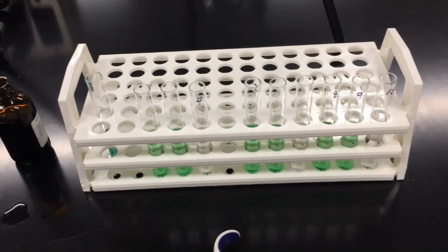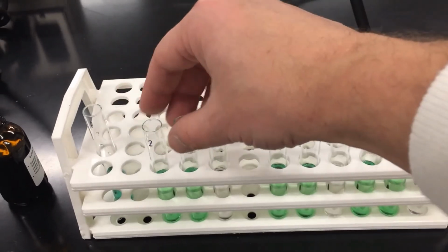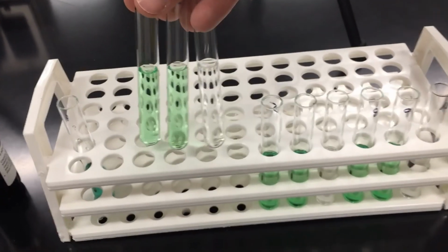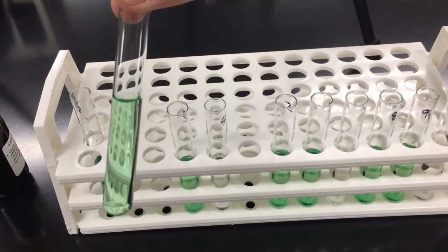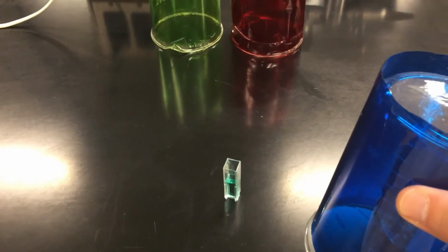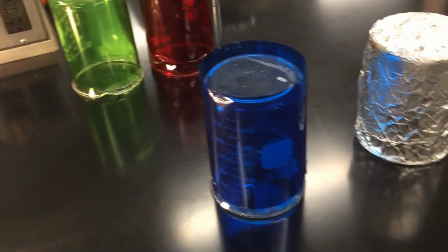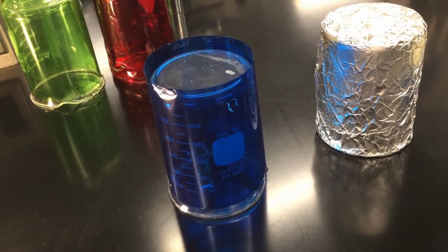Now that I've done my dark control, I can work on test tubes 2, 3, and 4. So these are my blue experiments. If you take a look, test tubes 2 and 3 have chloroplasts in them, and test tube 4 does not. So test tube number 2, just like what I did with the dark control, I'm going to add DCPIP to it, and then I'm going to vortex it and add it to a cuvette. So there's my cuvette, and just like before, I'm going to put one of the filtered beakers on it. This time I'm going to put the blue filtered beaker on it because this is one of the blue tests. I'm going to turn the light on, and I'm going to leave that exposed to blue light for 3 minutes, and then take my final measurement in the spectrophotometer.